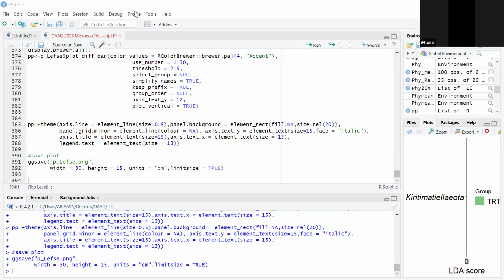Okay. What did you say? Is it the name of the sequencing platform? Yes. It was full length, but spike-in sequencing. So I have done it, and now I want to determine absolute abundance.